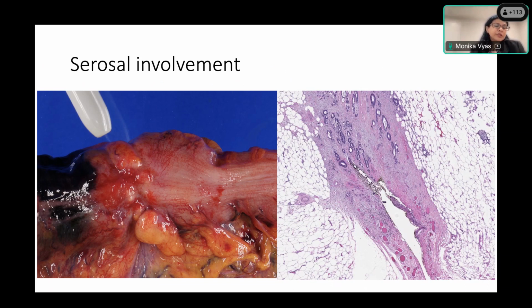And wherever you see the deepest extension, if you grossly can see obviously tumor extending on the serosa, you would submit that section, and submit multiple flanking sections. But what I would do is, if those sections do not demonstrate serosal involvement, or if there's only fibrosis in that area, I would go back and submit the entire puckered area, because involvement can be anywhere in this area. So that is one important thing. And the person who's grossing the specimen has to be aware of this, and make you aware of that in their gross description as well.